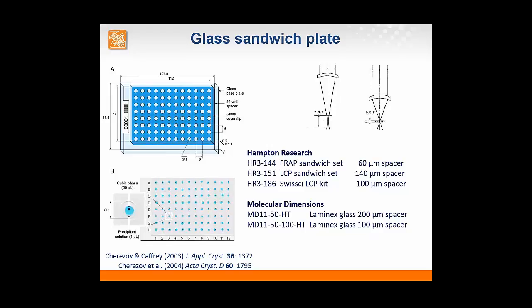In that case, the diffusion can be reduced to two-dimensional diffusion, and the equations to analyze this diffusion are the most straightforward, and by fitting with them, you can get accurate values of the diffusion coefficient.